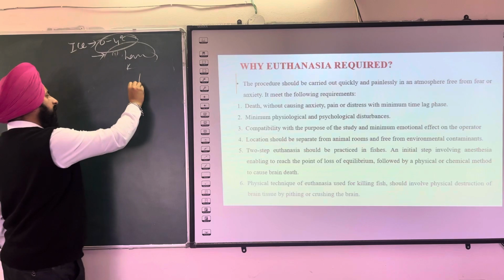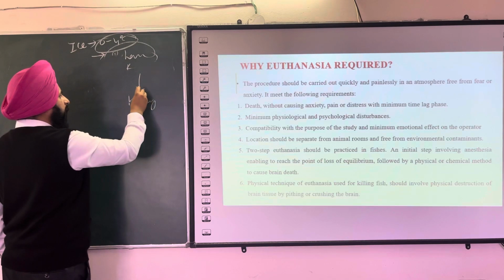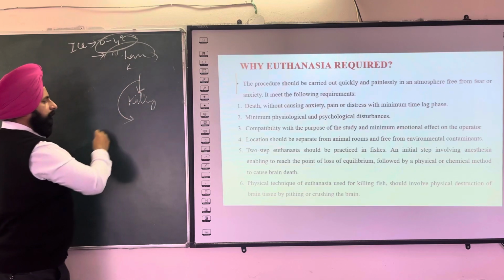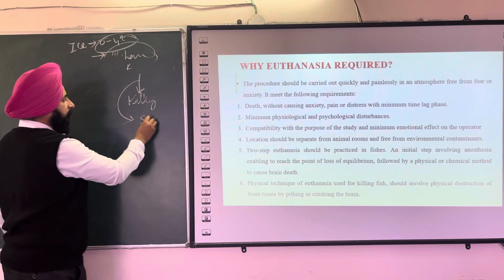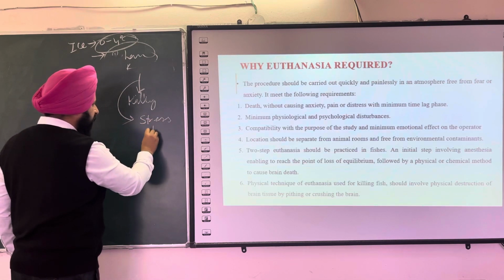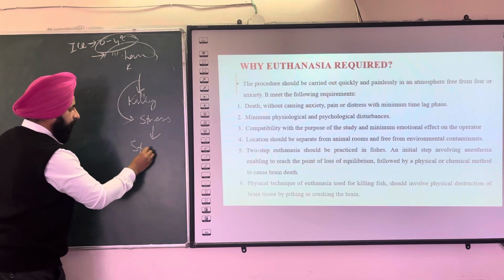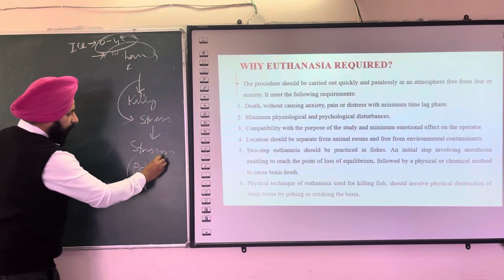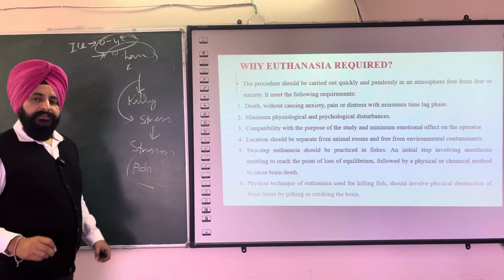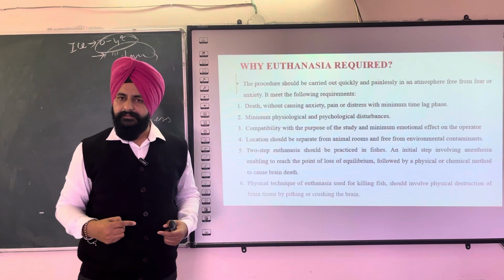Whenever you try to kill the zebrafish without anesthesia, it will undergo stress, and there will be a release of stressors like adrenaline and norepinephrine, which immediately increase the heart rate of the zebrafish.